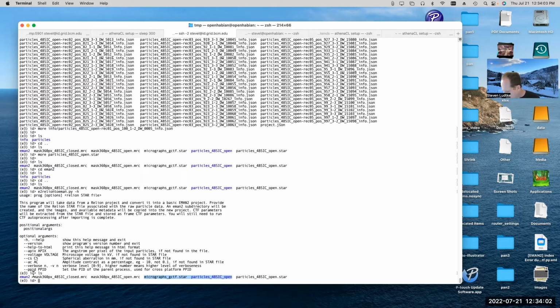What we're talking about today is trying to make use of a Relion refinement and the orientations from the Relion refinement to run one of these Gaussian mixture models to look at the variability among the data set. So in that case, we actually do want to preserve the Relion metadata. So there's another program which is stored in the EMAN2 examples folder right now.